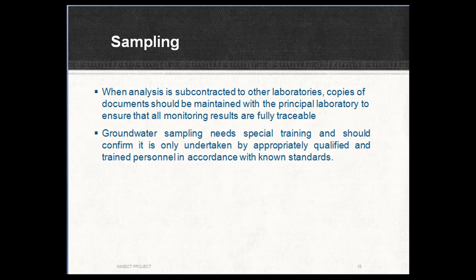Groundwater sampling needs special training. Ensure it is only undertaken by appropriately qualified and trained staff in accordance with the known standards.